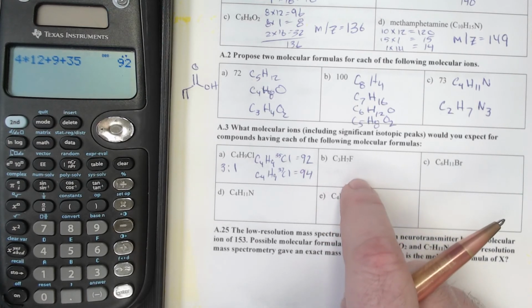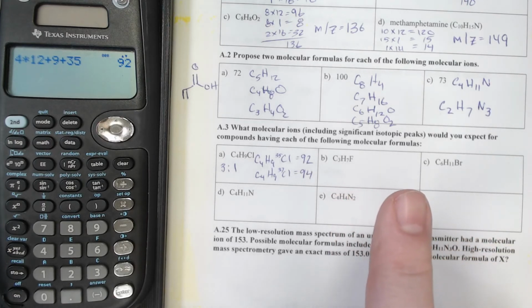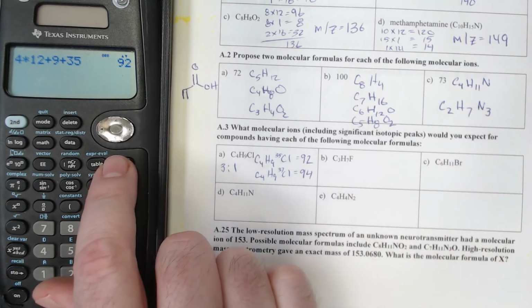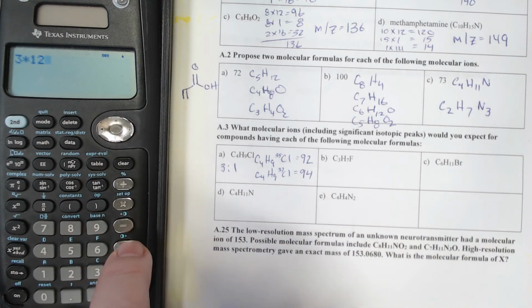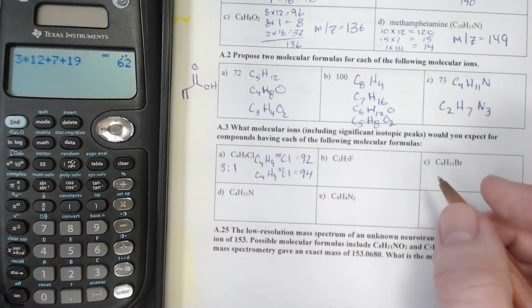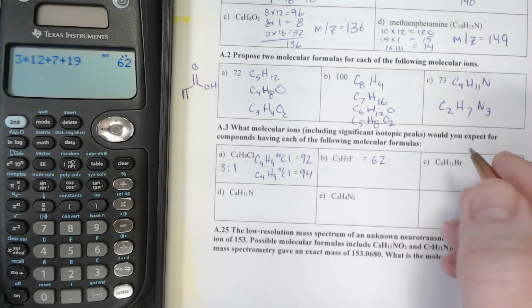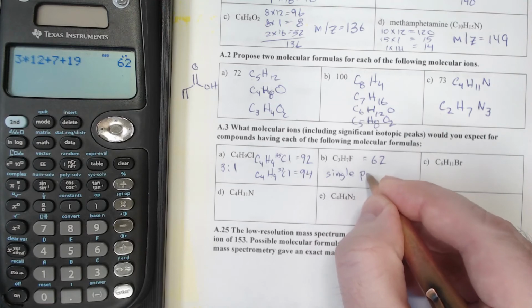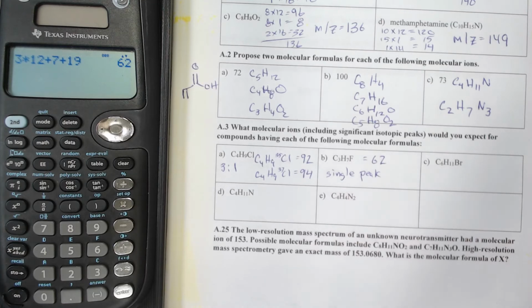Fluorine, you'll notice I didn't mention fluorine in the presentation, and the reason is that there's only one stable isotope of fluorine, and that is fluorine 19. So we can just stick with 19 for that. We'll do 3 times 12 plus 7 for the hydrogens, plus 19, and that's going to give us our molecular ion at 62, our m/z, and that should just be a single peak. We're ignoring the M plus 1 peak that's about 1%. We're just paying attention to major peak patterns.